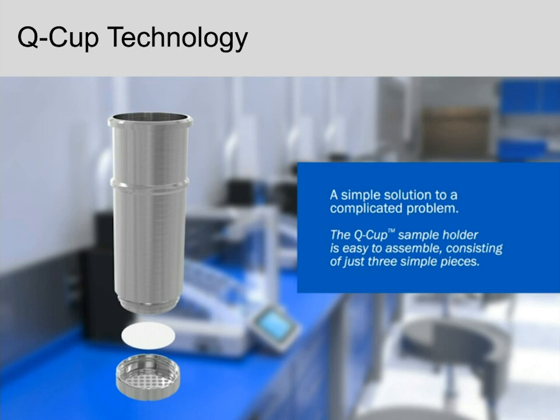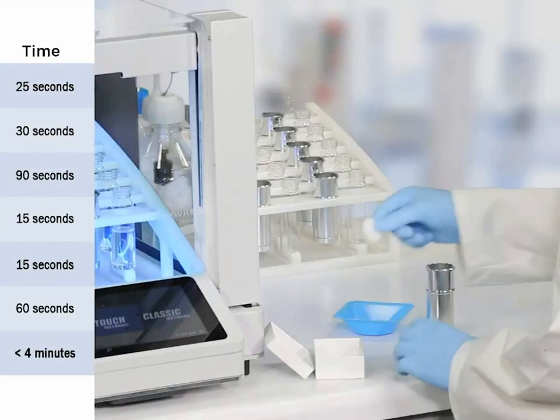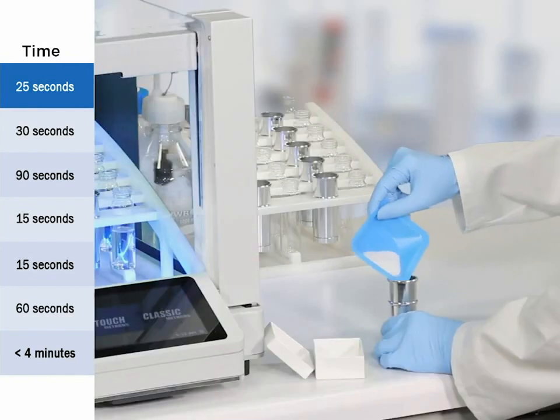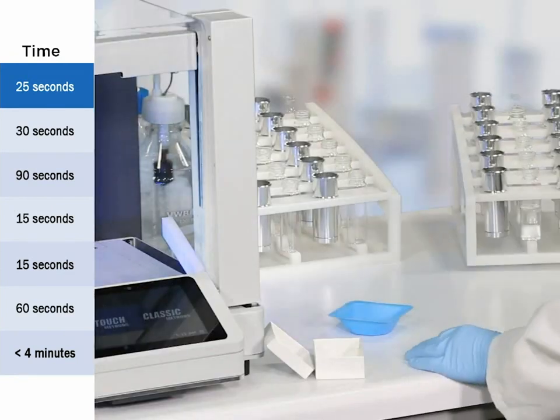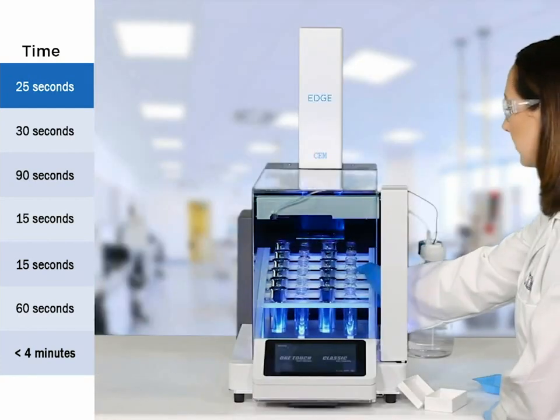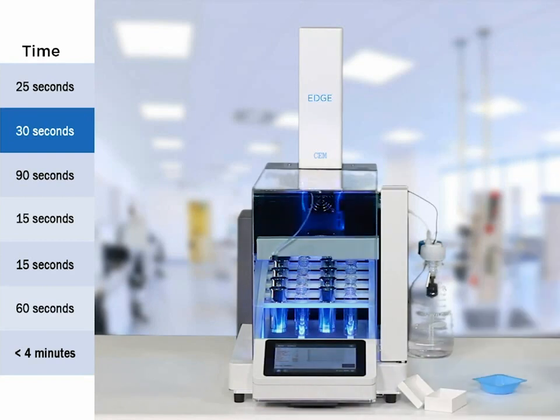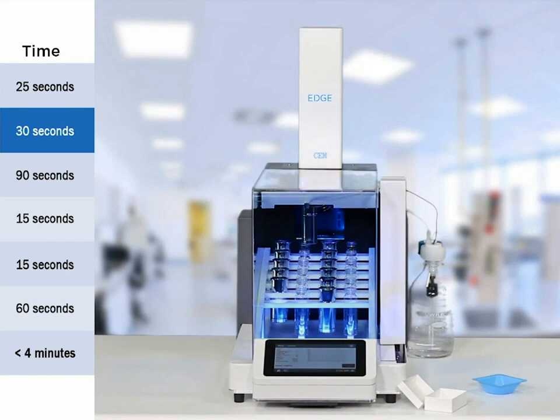Before moving to applications, I want to show a quick video of the EDGE actually running. Keep in mind that this is real-time — the EDGE is running all these steps as fast as they're happening in the video. The Q-cup has been assembled with the Q-disc, the sample has been placed in the cup, and racks are removable so you could be preparing one rack while another is running. A couple clicks and your sample is running.